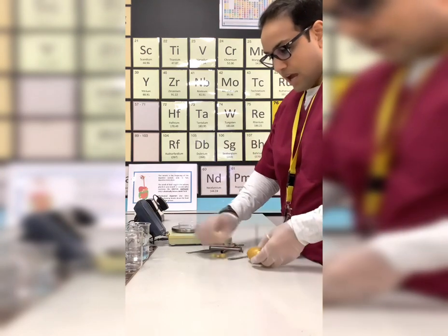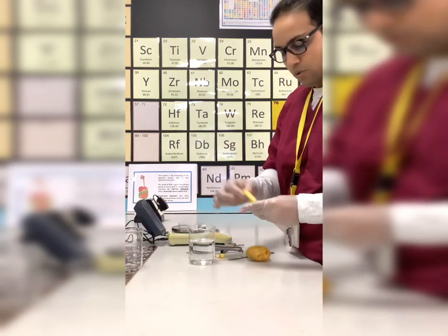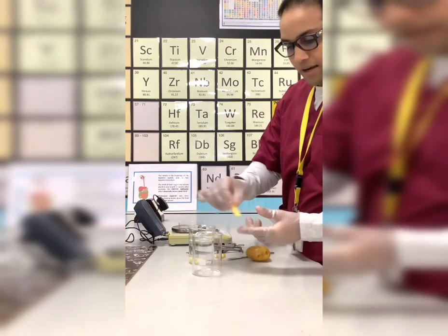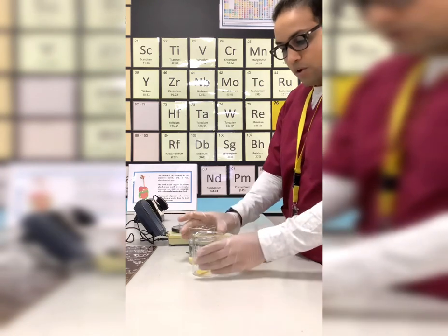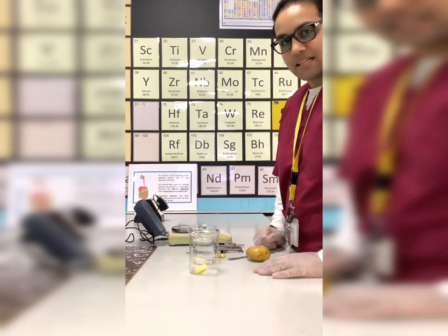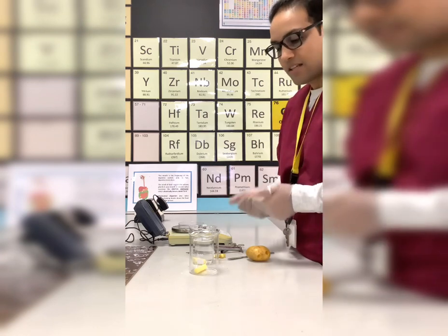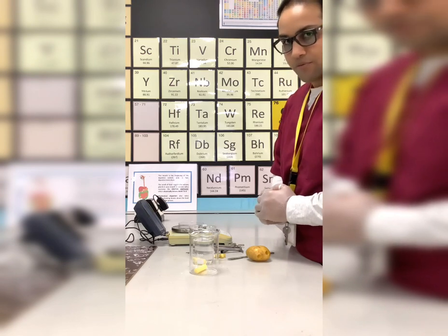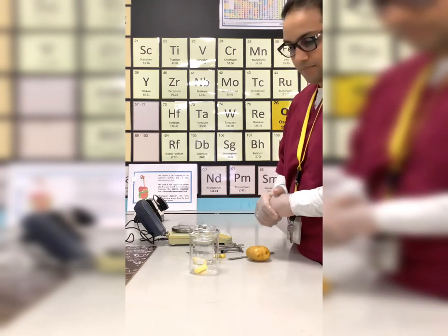We are going to now place one of the potato cylinders in distilled water, whereas the other one in an empty beaker. We're going to keep this for 24 hours and then check what is the mass, whether the mass is increased or decreased in which of these 2 beakers. So let's wait for 24 hours and see the results.